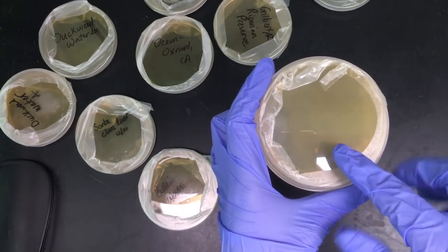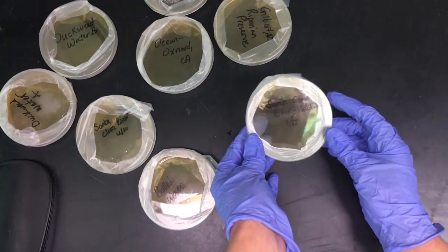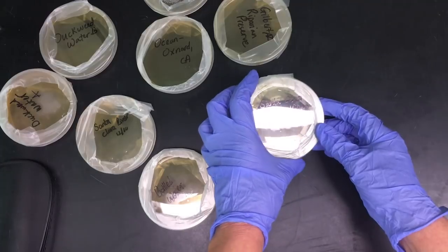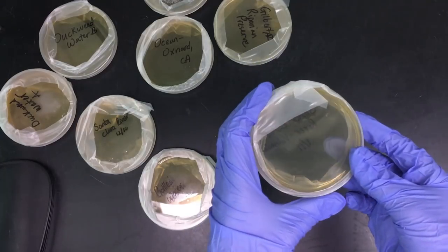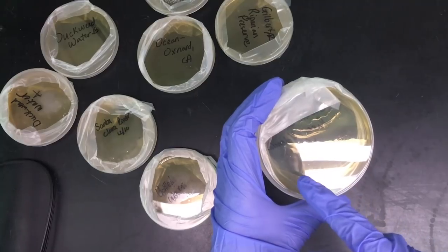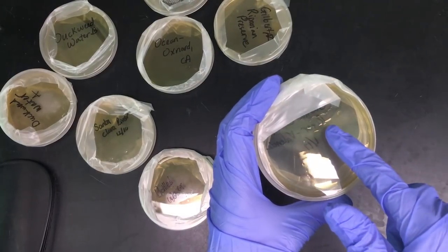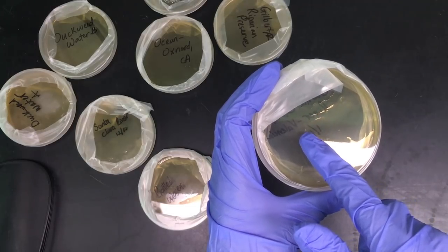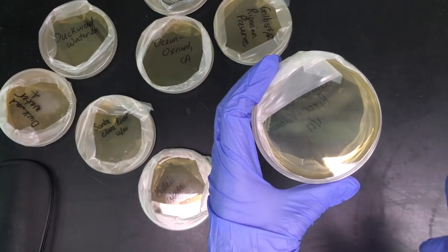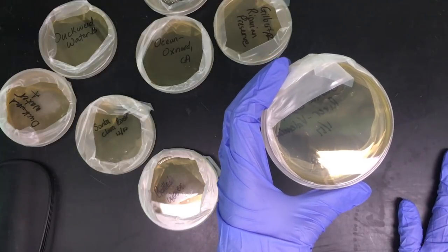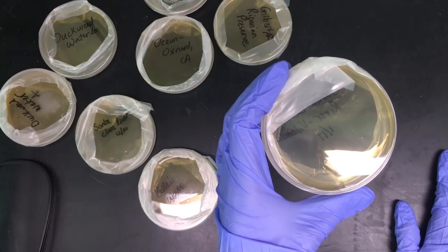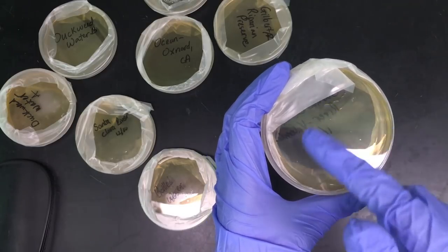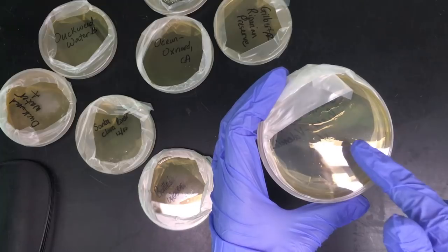Now we'll do some Santa Clarita River water collected on the Valencia side of the Santa Clara River. And this one is positive for a couple, there's one there, so one, and then there's one here, so two small colonies of coliform. This could be runoff from dog poop or some sewer lines, but probably just mammals, even coyotes or something that live along the riverbed, and so that's what this is from. We'll say two colonies in that water.